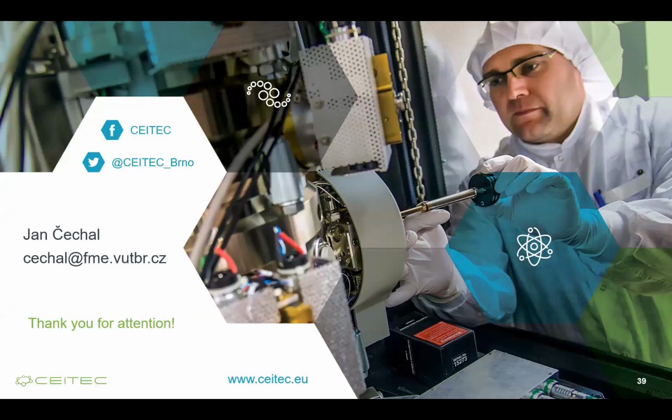Thank you very much, Jan, for this nice instructive talk and demonstration of such an interesting technique. And I have here one question in the Q&A section. I will read it. The person says they missed the beginning of the lecture, and the question is whether it is possible to image biopolymers like yours, and why the silver substrate was used in all imaging results. Why not other noble metals or other substrates?